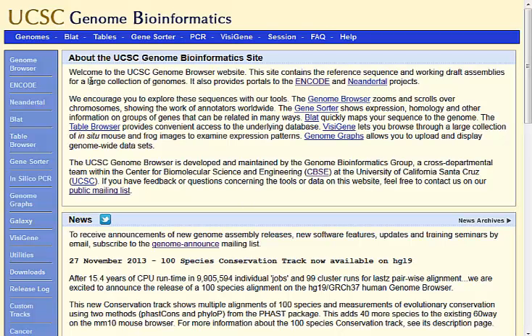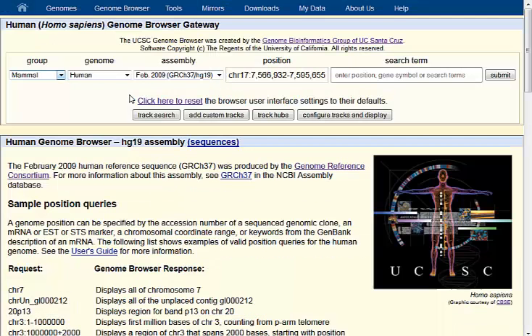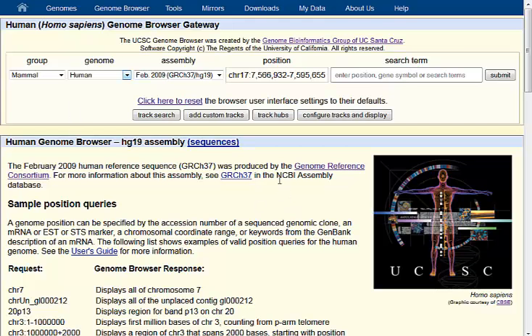If you go to the UCSC Genome Browser site, you know you have access to dozens of genomes, so I'm going to click the link for Genomes or Genome Browser here to get to a gateway. You have access to all these genomes that are available here. But in addition to the data provided by the folks at UCSC — all the reference genome data and annotation data available here — researchers around the world can also overlay their data onto the UCSC Genome Browser using the track hub mechanisms.